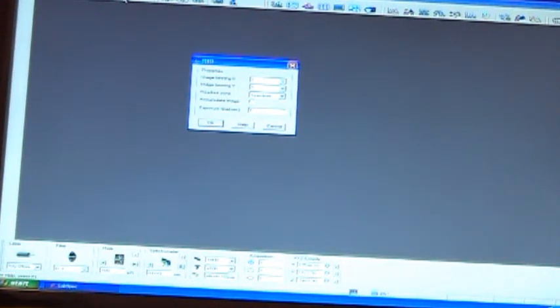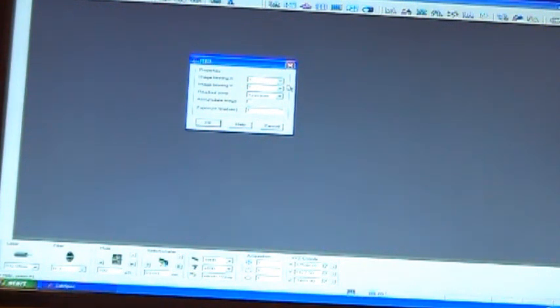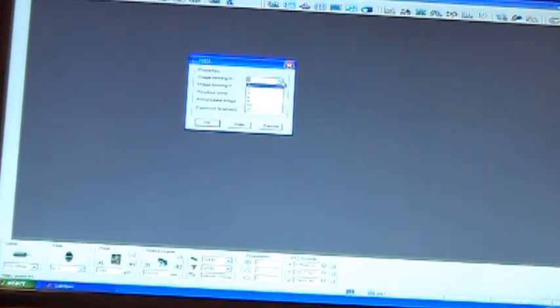But as you combine pixels together, you have to sacrifice resolution for speed. So for example, if you have a map that's going to take you 15 hours to run, if you do binning X and binning Y, both by say 2, your 15-hour map will now be done in 10 hours. Not sure if that's the right time, just a guess, but it'll be done faster. But you'll have to sacrifice a little bit of image resolution because now you're not using all the pixels. And you can bin all the way up to 32 times, which is really horrible resolution, but you will get map data really, really, really fast.